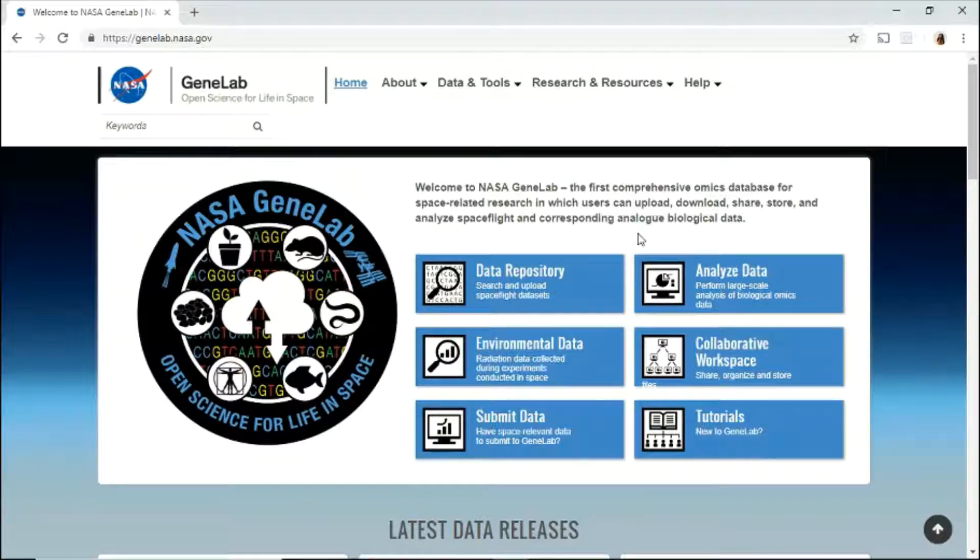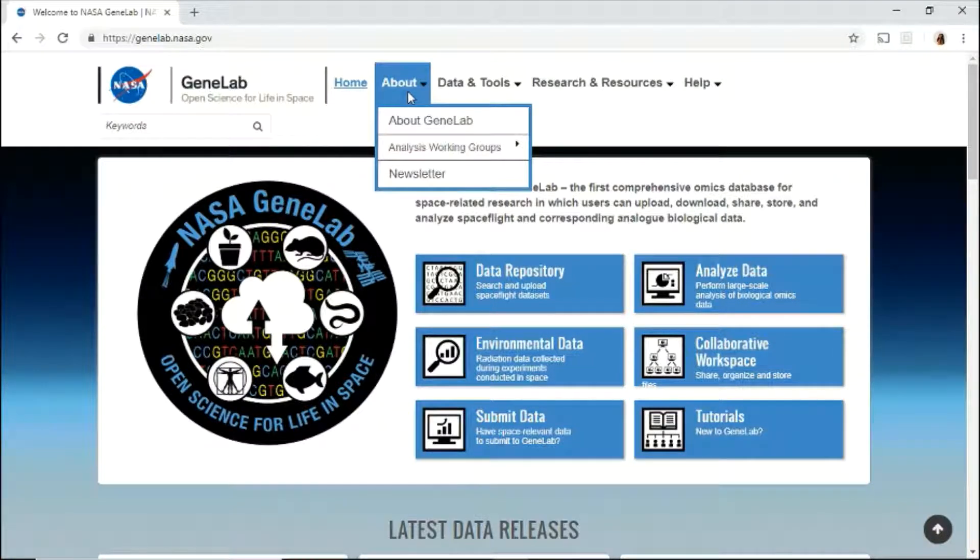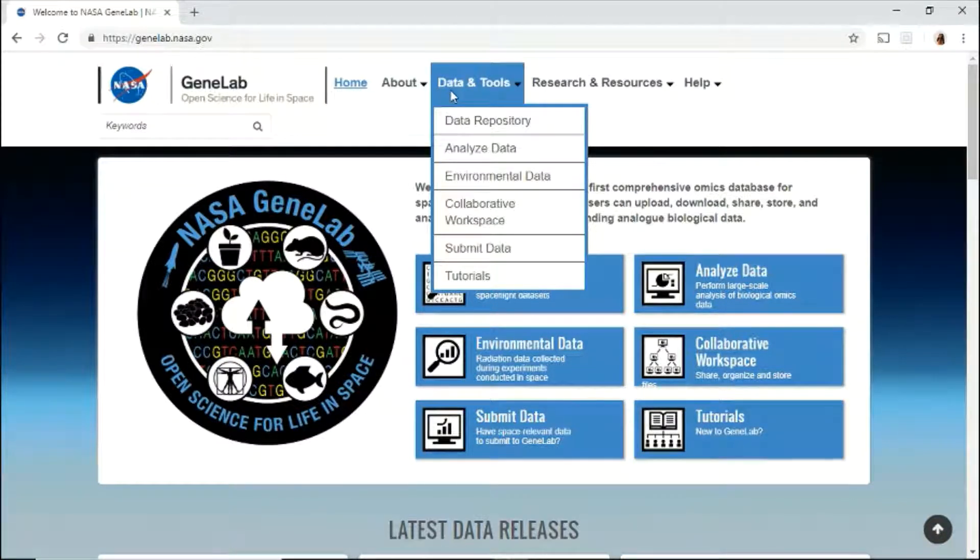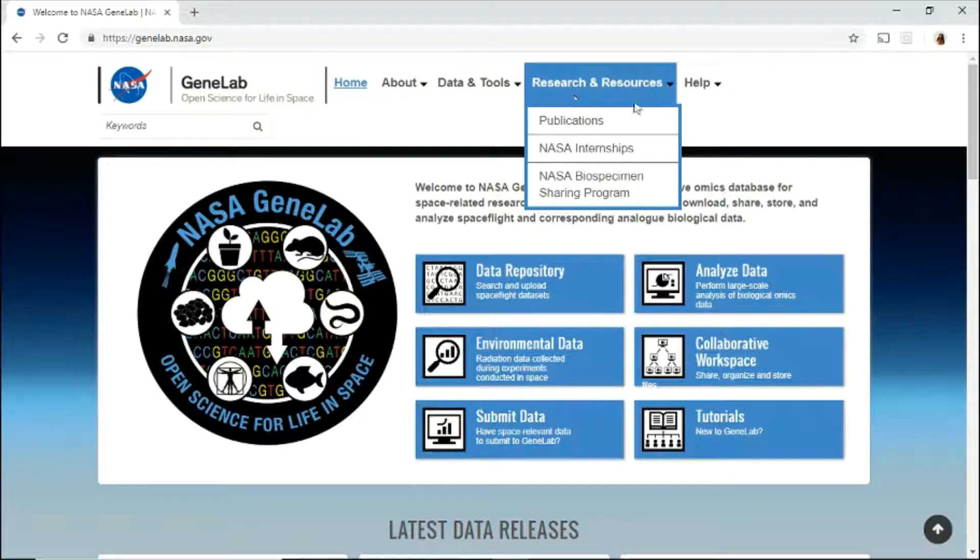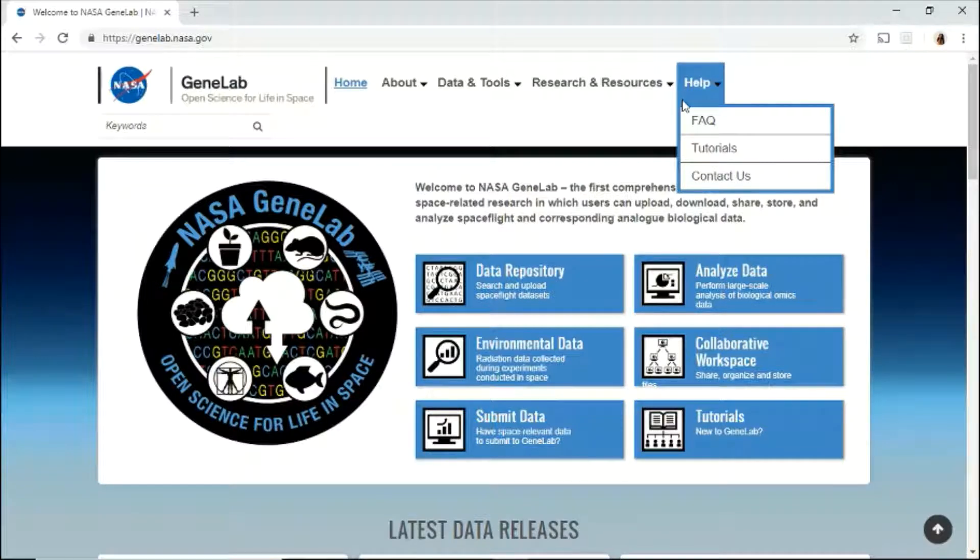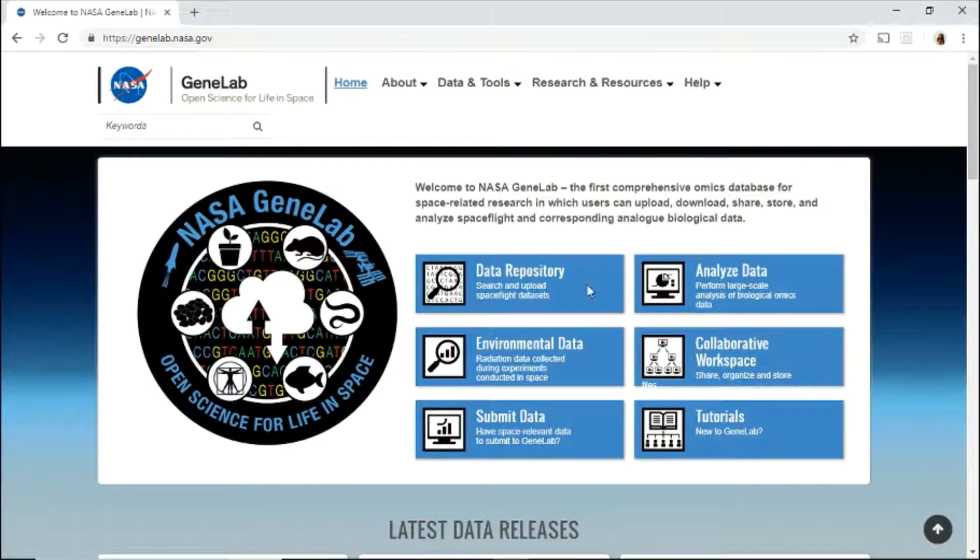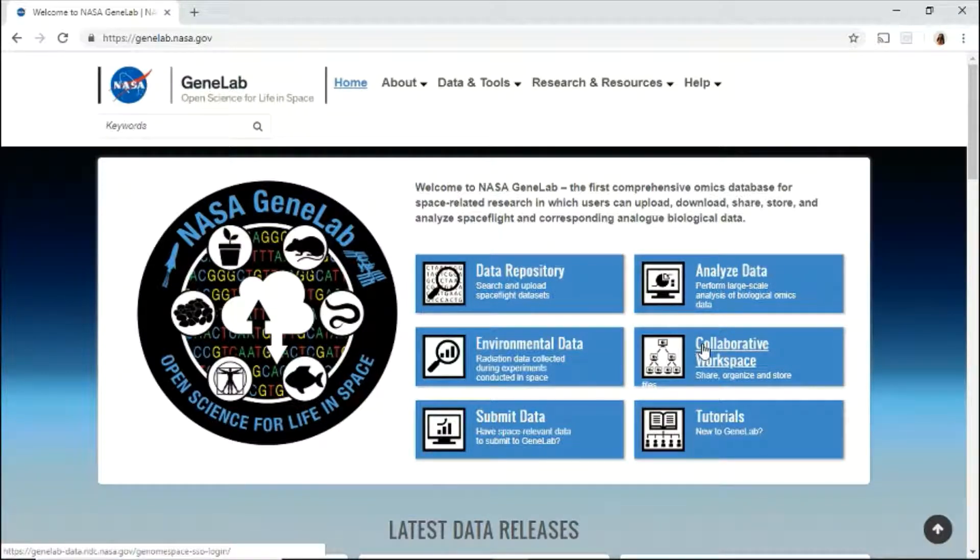On the home page, use the top menu to navigate through the different pages. Learn about GeneLab, explore the data and tools, find information about research and various resources, and use the help menu for tutorials and contact information. You may also use the buttons here to navigate through the various data and tools available in the GeneLab data system.